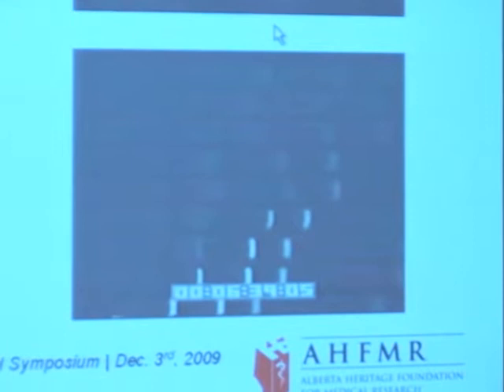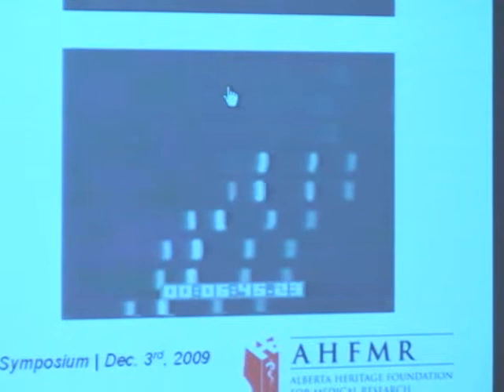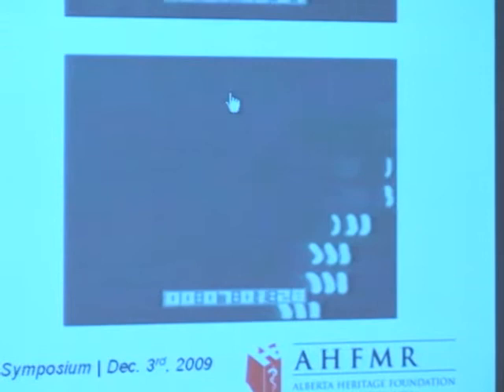This is kind of the same thing, and here you can see it's the same sample getting digested and moving along those channels, probably just later on than here. And you can see these peaks starting to form, and what's happening actually is the dye is finding the DNA and making it start to glow. So these peaks are just kind of appearing as the intercalator reaches the DNA. So it's neat to be able to watch this stuff in real time.